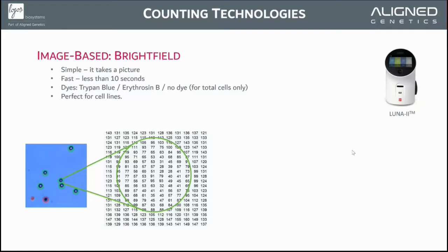You can see here in the bottom left that your cell is round. The software is going to look at the roundness of the cells and the brightness, and it will compare the pixels inside your cells, which is the foreground, with the background. So if you have cells above 8 micrometers, then you will have an accurate counting.